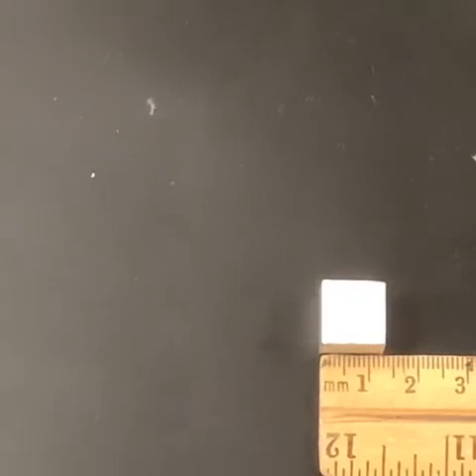All right, so for the first one here, sorry that's shaking. For the first one, we have our aluminum cube, and we know that we are trying to find the mass and the volume. So for the cube, because we have length, width, and height, we could go ahead and take this measure ourselves.